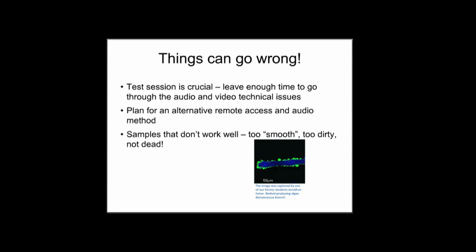to have an alternative for remote access. Whether we use a program called Zoom, there's other things like Google Remote Desktop and Team Viewer, so maybe having an alternative as well as an alternative audio method. That seems to be the thing that trips up the situation mostly is audio, and it's hard to have a really good experience without some audio. And so I've had teachers just call in on their cell phone or on the landline phone or use Skype in addition to the remote access software.